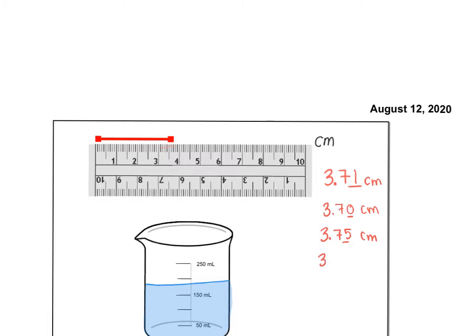I think it's 3.68, right? That's estimated. We're just before the 3.7, or 3.69 maybe. All of those would be accepted. So that last digit is kind of in a range.